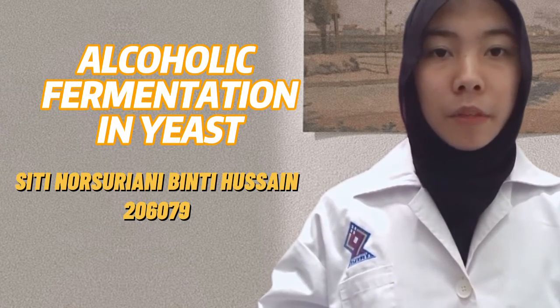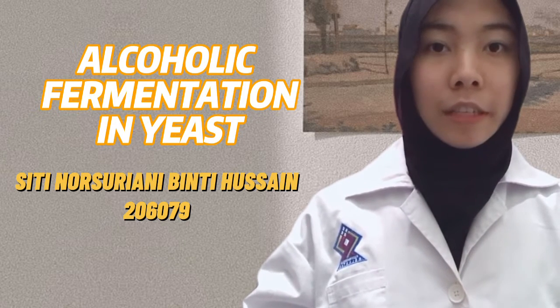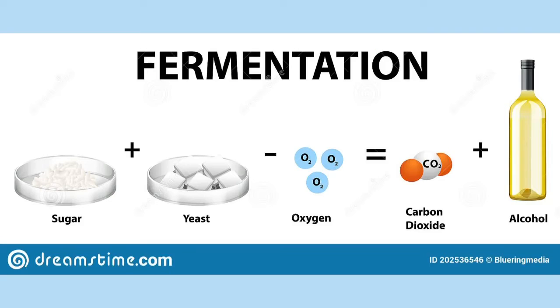Today, I'll be performing an experiment on alcoholic fermentation in yeast. Fermentation is a process whereby yeast are converting sugars into ethanol, carbon dioxide, and other metabolic byproducts in the absence of oxygen, that is giving the chemical composition and sensorial properties to the fermented food.